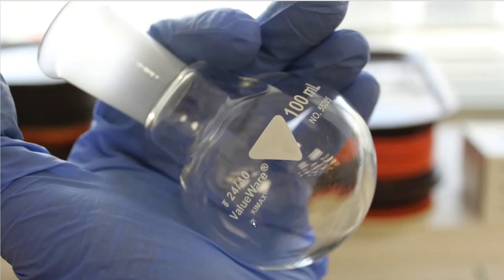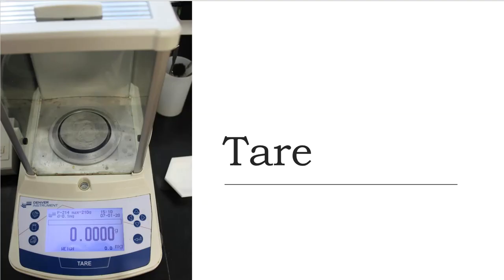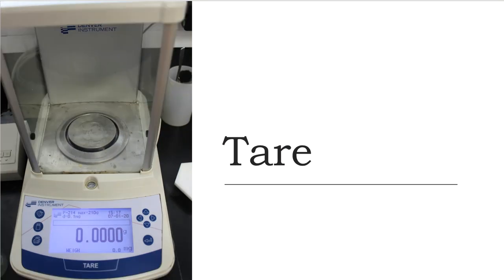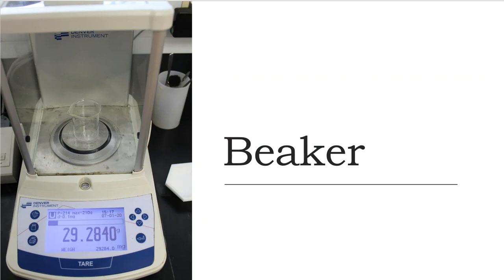So I took another round bottom boiling flask, and that's what you're seeing here. I went to the balance, and I tared that balance out, of course, and I put my flask on it, and that flask had a mass of 62.2653. All right, so I did another tare on the balance, and I also weighed a beaker, and that beaker was 29.2840.